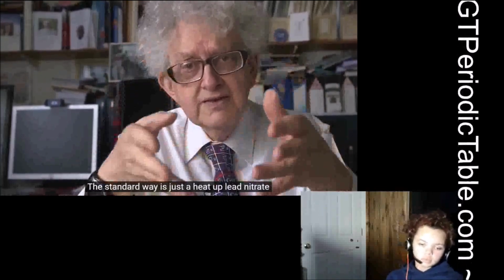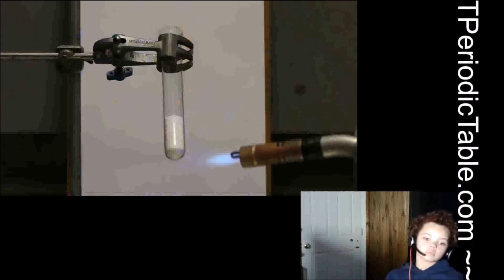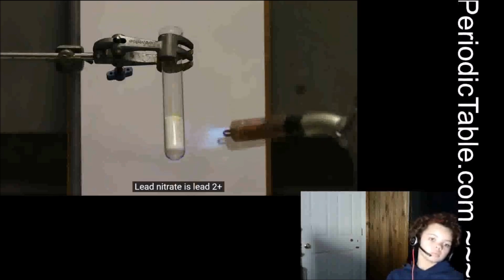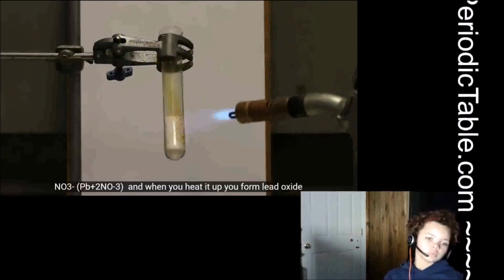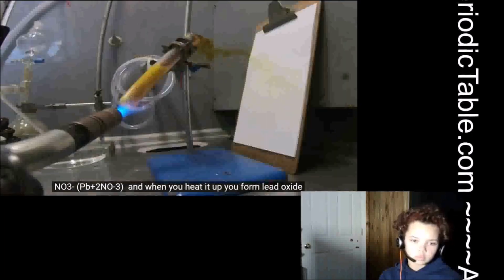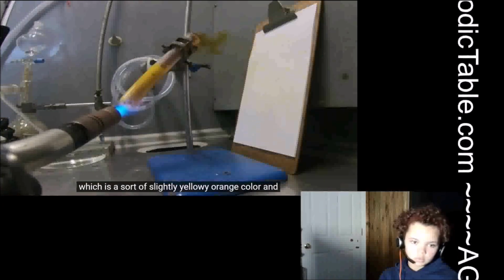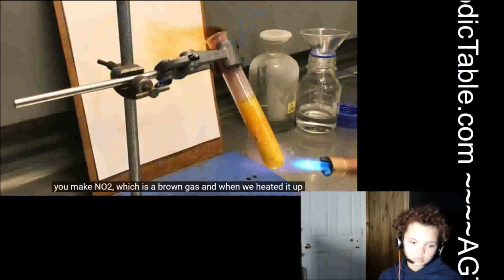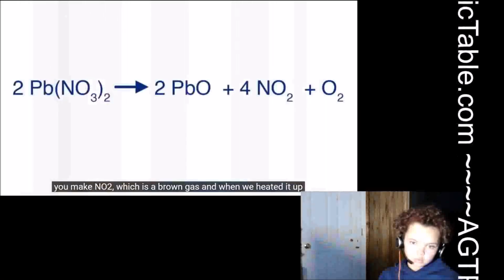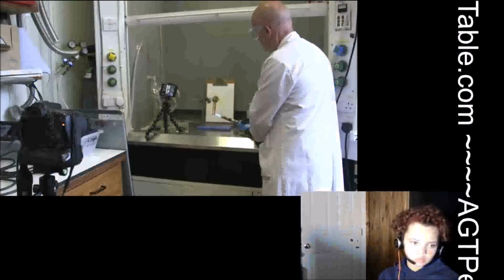The standard way is just to heat up lead nitrate. Lead nitrate is lead 2 plus NO3 minus. And when you heat it up, you form lead oxide, which is a sort of slightly yellowy orange color, and you make NO2, which is a brown gas. And when we heated it up, we got really quite a substantial plume of NO2.